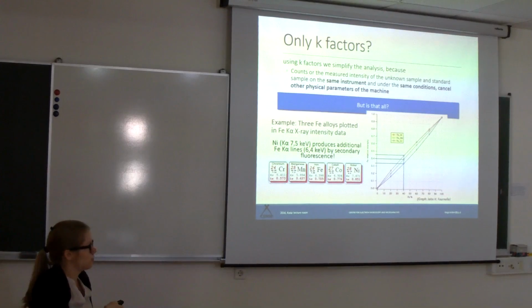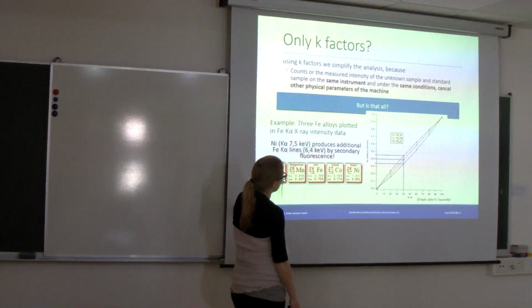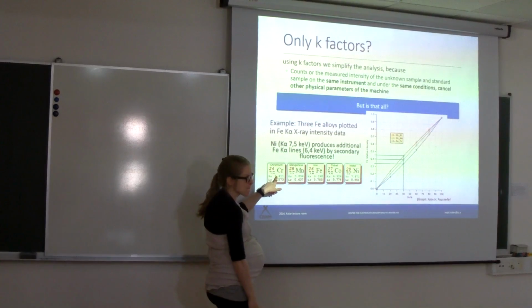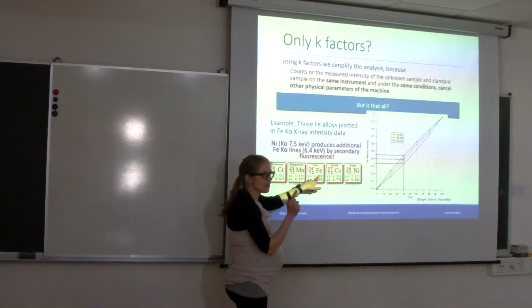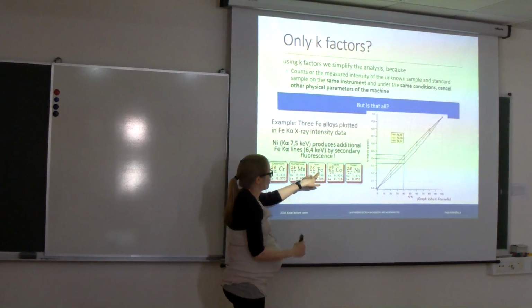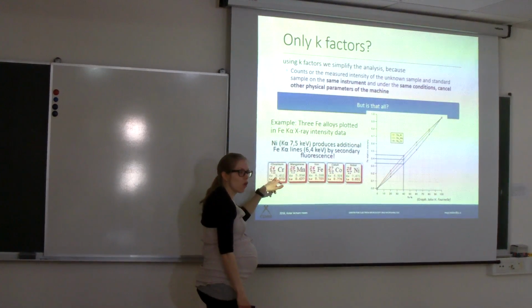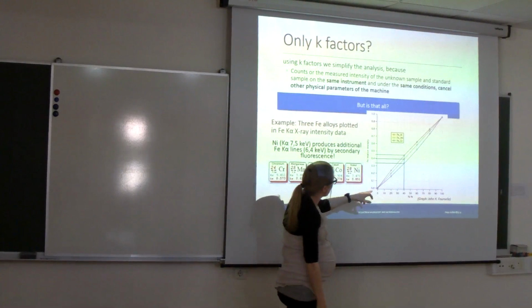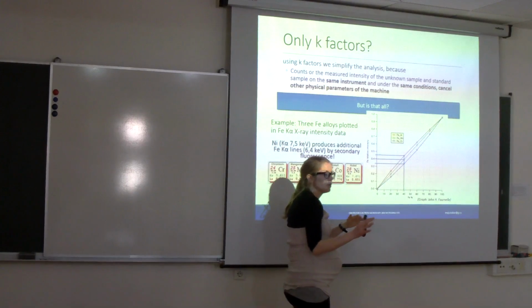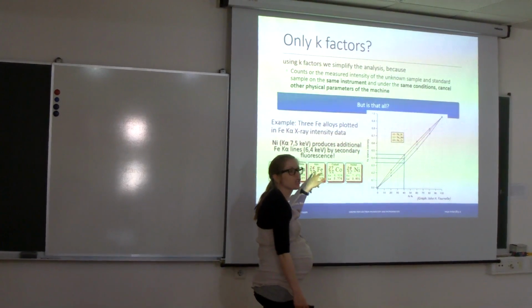Do you get it or no? Okay. So you have iron, chromium and nickel. Chromium has a lower energy. That means that when the incident electron beam excites the iron, you will produce an X-ray of iron, and around it, if you have a chrome matrix, that X-ray will be absorbed in that matrix and produce a chrome X-ray. So in this case, you will have a lower detection on your EDS for iron. And the same for nickel, which has a higher number, so you will see more iron than it actually has.